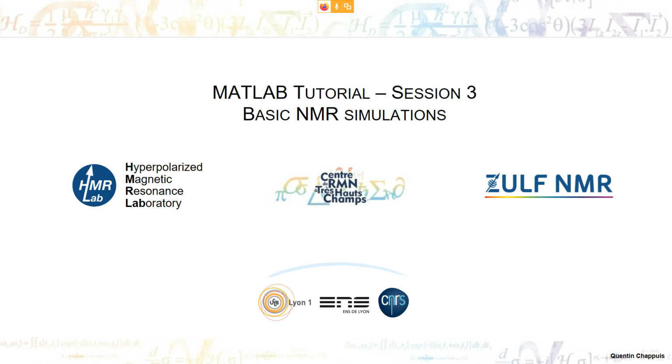Before starting, I would like to say that there are many softwares out there that are well optimized to do NMR simulation, for example Spin Dynamica, Spinach, or Simpson, probably many others. What I will show you is not how to use these softwares, but rather how to construct a simulation from scratch, which is probably not the most efficient way to get to the result, but it is, to my eyes, a good way to learn how to use quantum mechanics in NMR simulation. For me, it has been very helpful to go really from the quantum mechanical definitions to MATLAB. I hope it will be useful to you too.